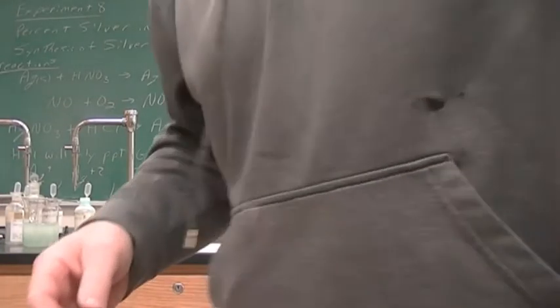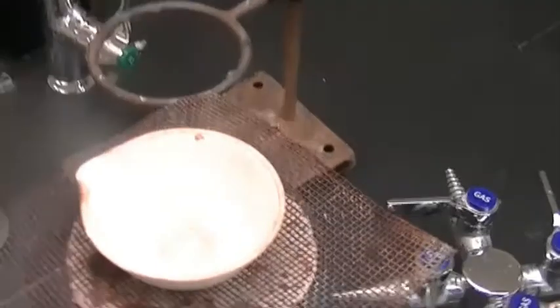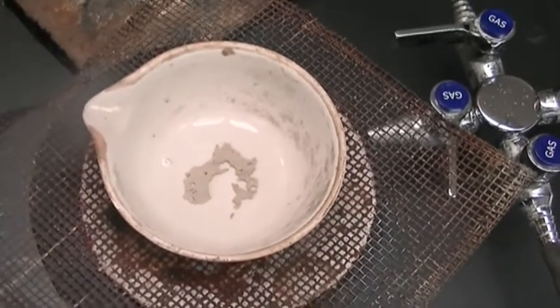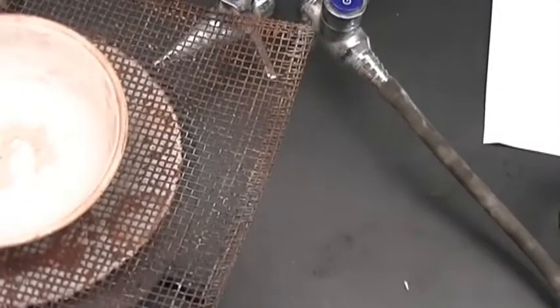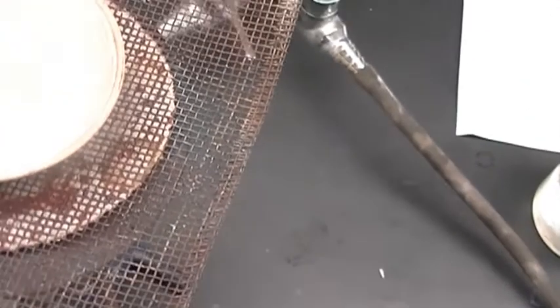Let me show you what that looks like. At just without heat, your nitric acid with the silver, it may eventually react, but it will take a while. If it reacts ever, it probably would just evaporate the nitric acid out. All right, so it's going to take some heat for this, so let's go ahead and turn on our heat.